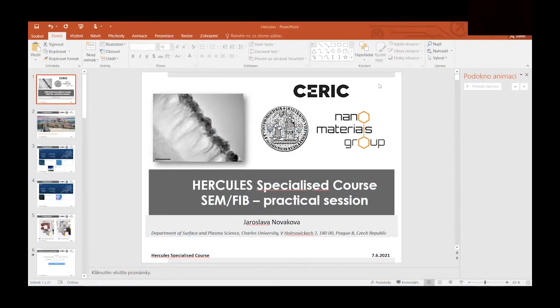I will speak today about scanning electron microscope and focus ion beam. Thanks to Corneliu Gica, you have some idea about electron microscopy. So I will go just really briefly through some theoretical stuff, and then later on I will be more focused on focus ion beam and gas injection system, and also on practical stuff. I will show you how to use the microscope, what we are able to do and what we are not.